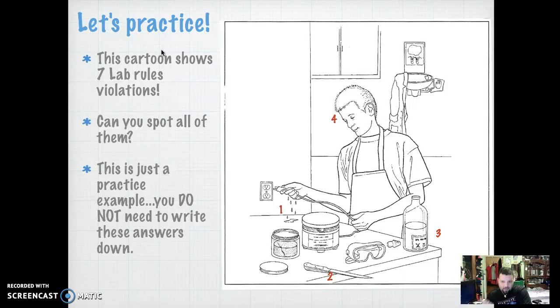Let's see another one. His goggles. His goggles are on the table and not on his face. That would be a violation, especially if you're working with a chemical. How about another? Do you see another example of an incorrect? Right back there. That is called an eyewash. The eyewash is for facial protection if we were to get a chemical in our face. And the eyewash is being covered right now by a lab coat. That's a no-no. You can actually get fined for that in a real life lab situation.